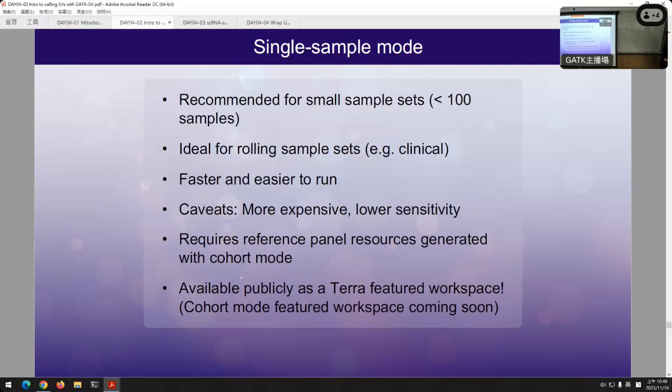And finally, the single sample mode of GATK-SV is available publicly in Terra as a featured workspace. So you can go to Terra right now and find this. The cohort mode, we're working on getting our workspace featured, but it's not quite there yet. So we're hoping to make that public very soon.